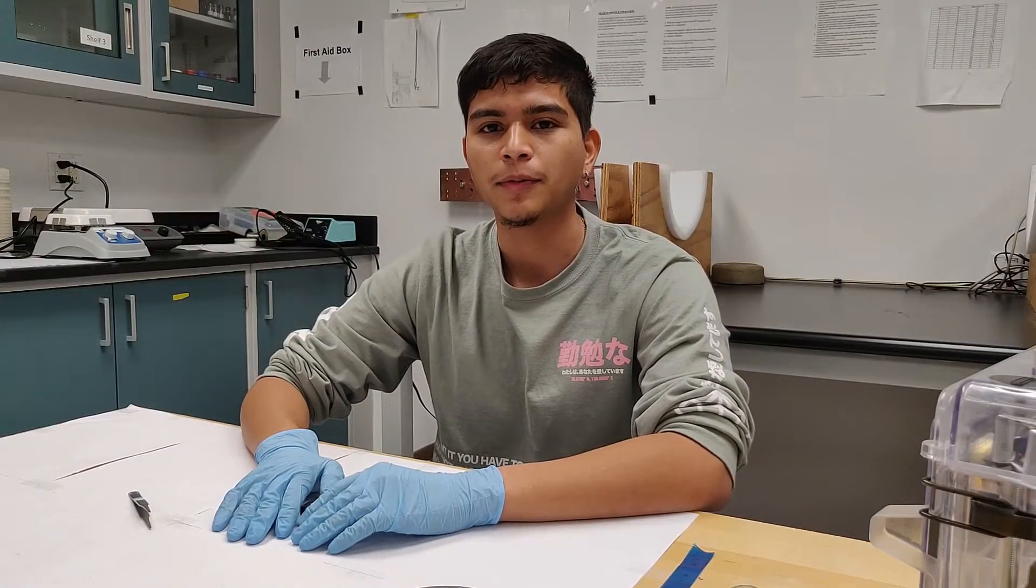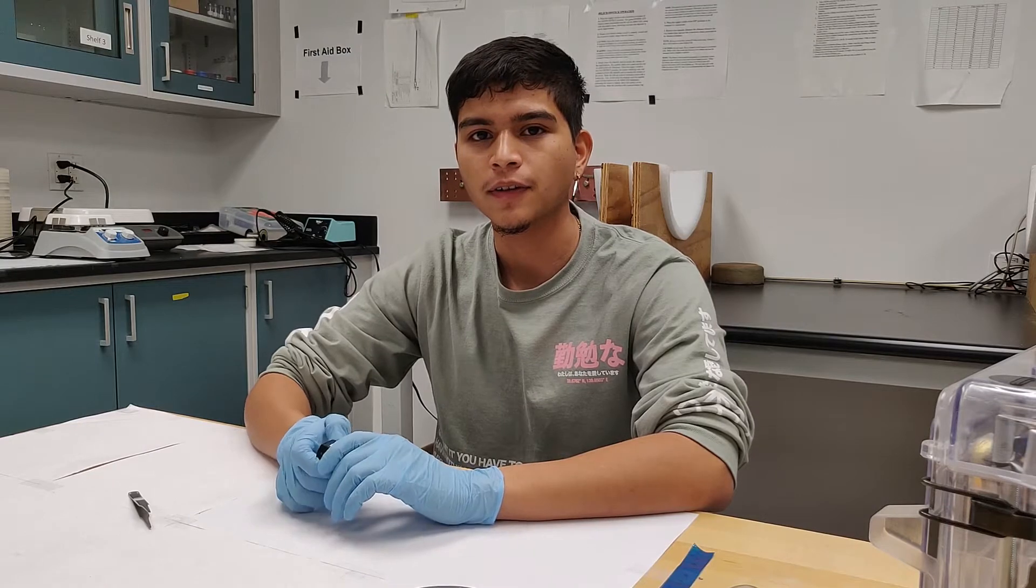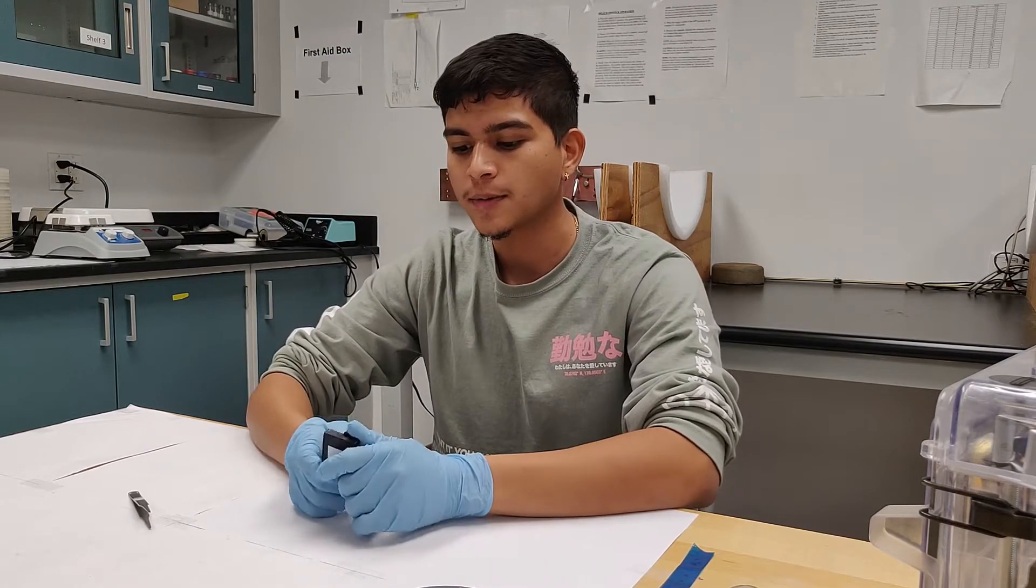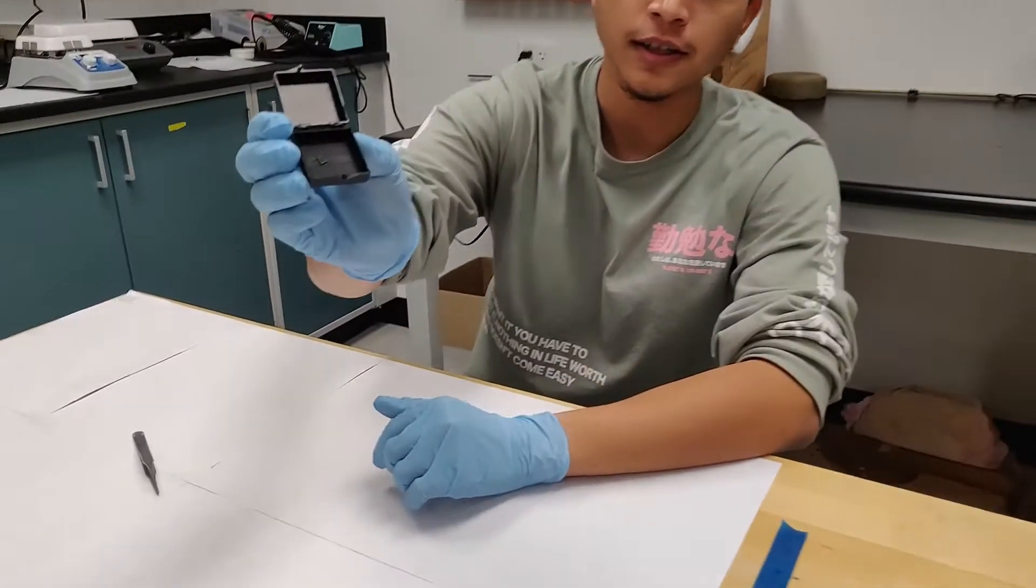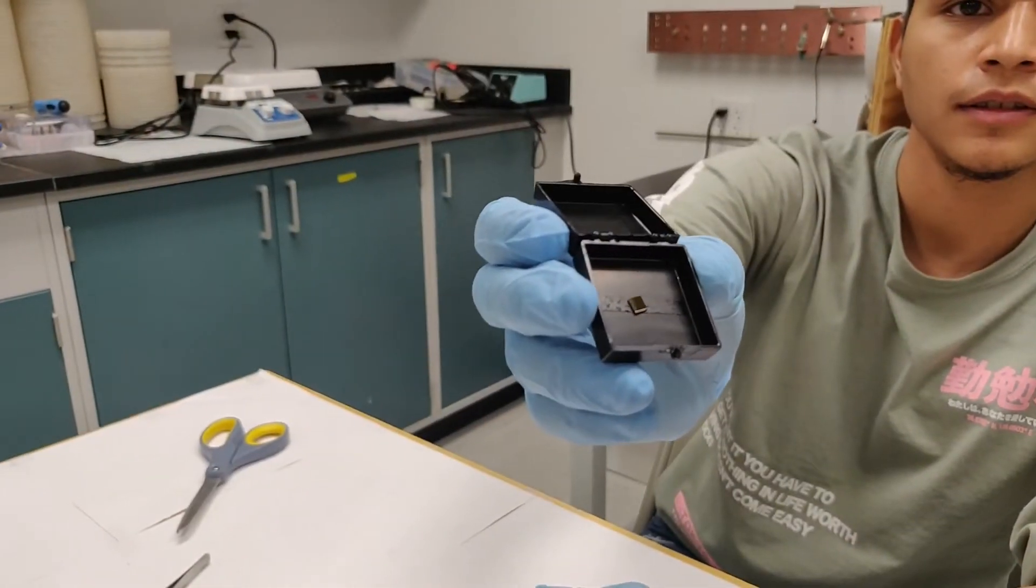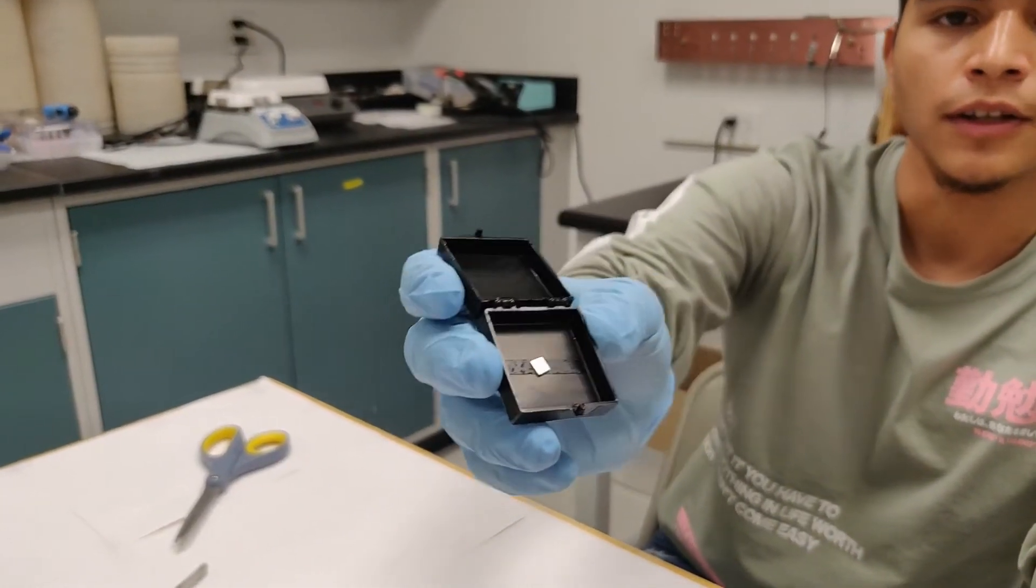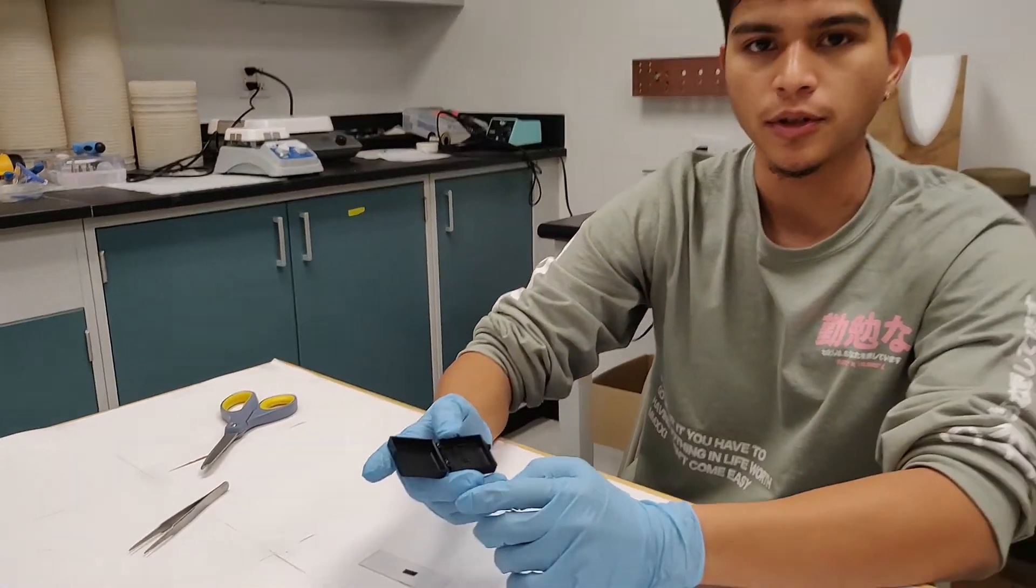Today I'll be performing a mechanical exfoliation using Scotch tape of MOS2. The substrate that I'll be using is silicon dioxide. But this isn't the 2D material we'll be exfoliating, right? No, this is the substrate that will host the 2D material.